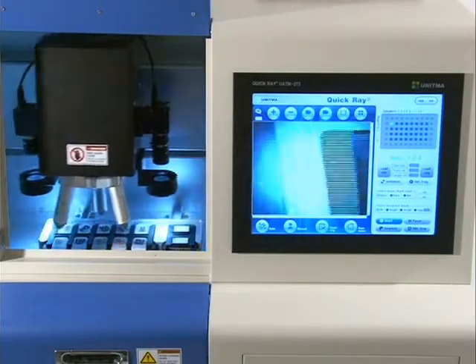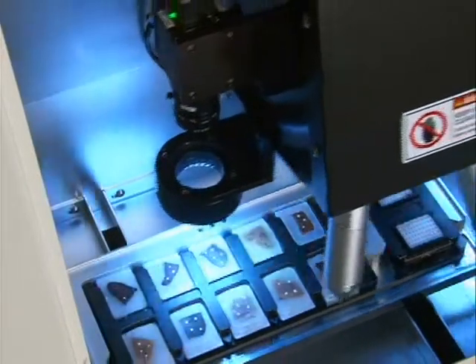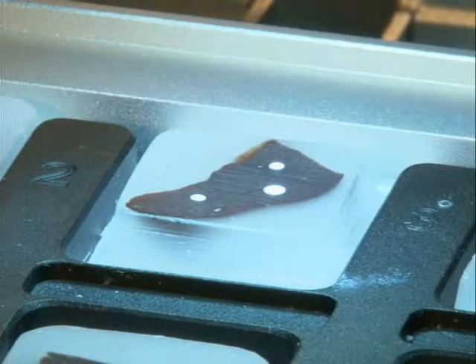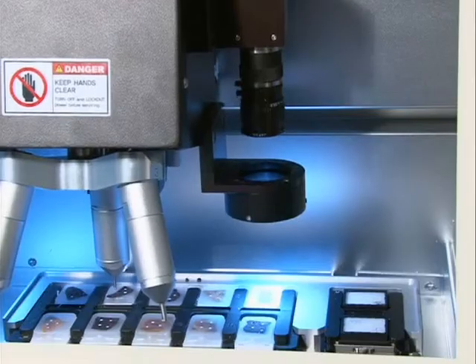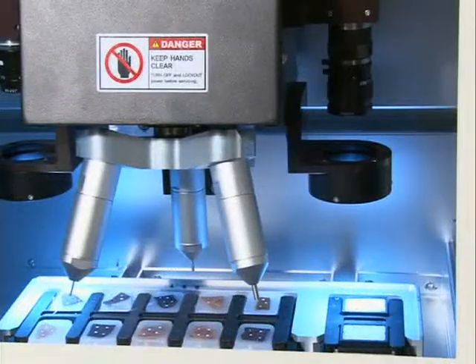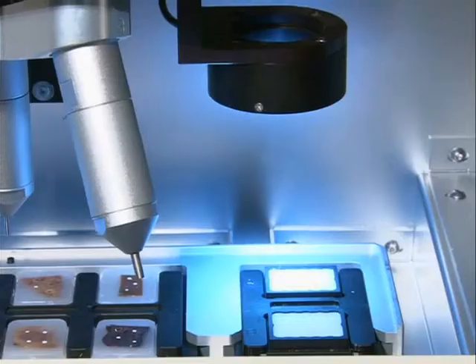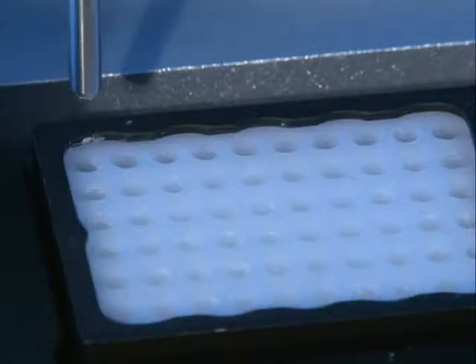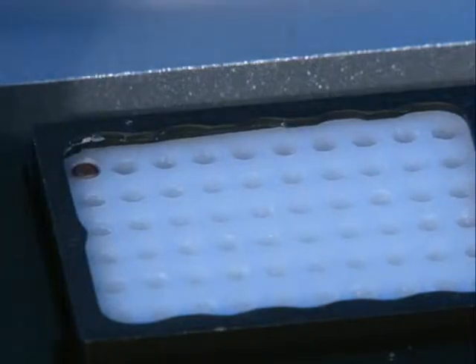The basic operation of this instrument is divided into 8 steps. First, the camera moves to a donor block. Second, capture a tissue sample image from the donor block. Third, get the coordinates of the sample. Fourth, pick up the sample. Fifth, the camera moves to a recipient block. Sixth, detect the center of the hole of the block. Seventh, calibrate the coordinates of the block to move a tip. Eighth, insert the sample. The 8 steps are included in one cycle.